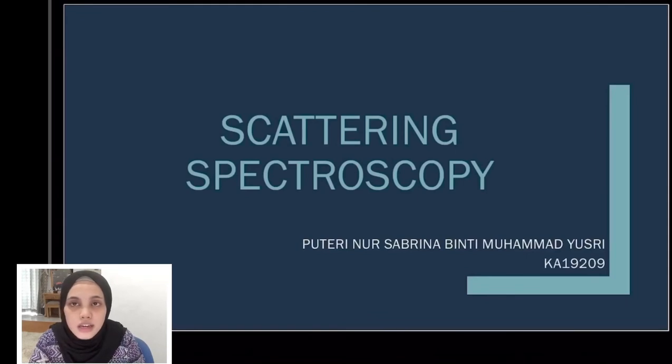Today I will explain about scattering spectroscopy. For your information, scattering spectroscopy has other different names such as Raman spectroscopy and light scattering spectroscopy. Even though the names are different, the function is still the same. So I decided to explain more about Raman spectroscopy in this slide.